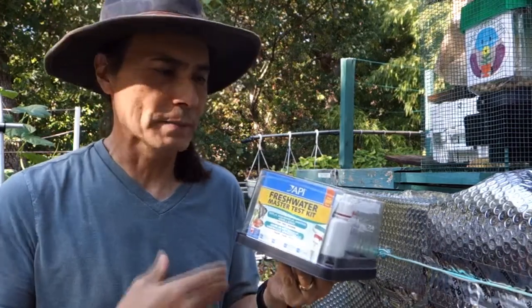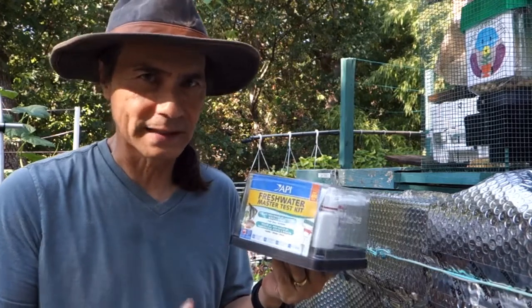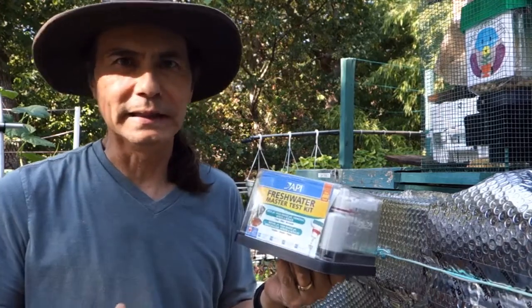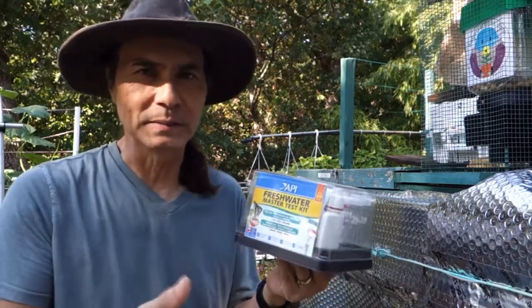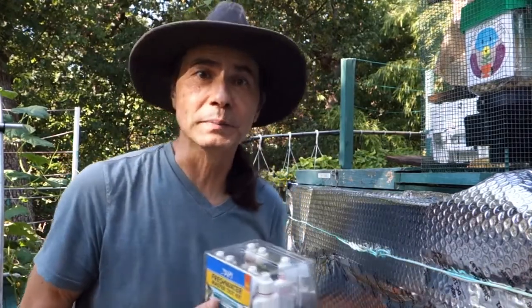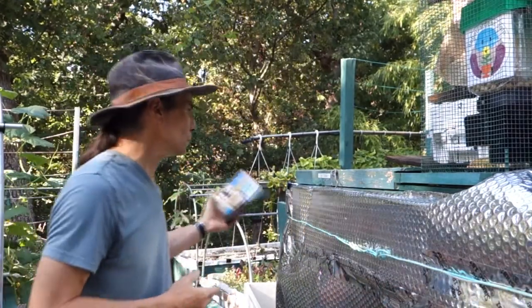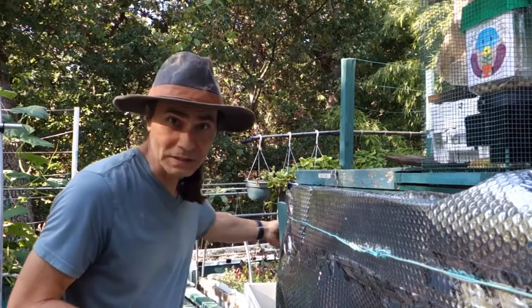But it's quite accurate and it's quite reliable. There are other companies that make similar tests. There's other tests that can be done for things like alkalinity, potassium, etc. for all sorts of tests of this ilk that can be used. But it's not automated.